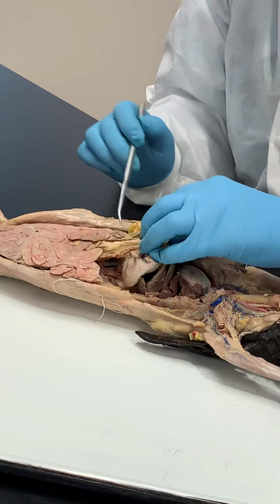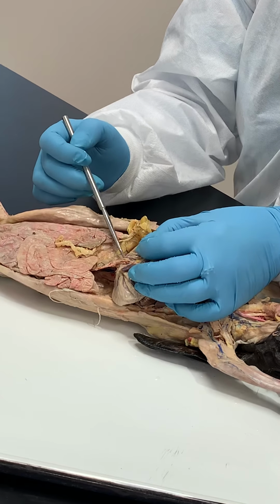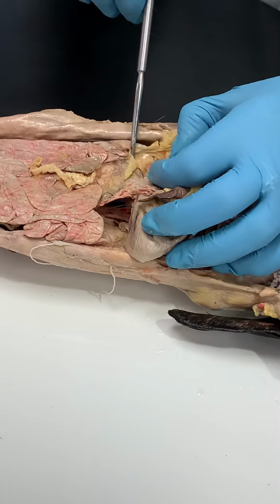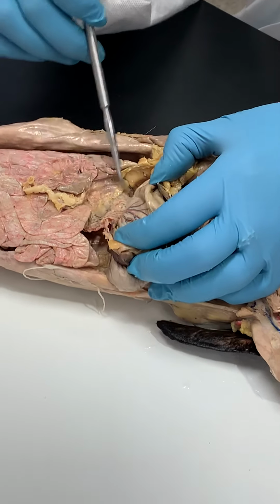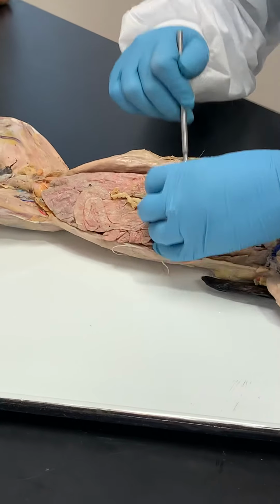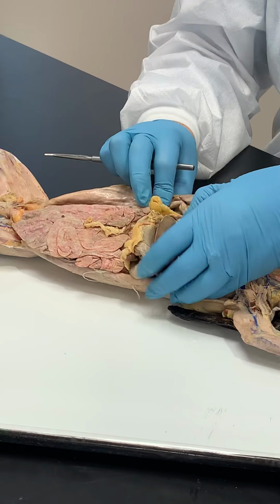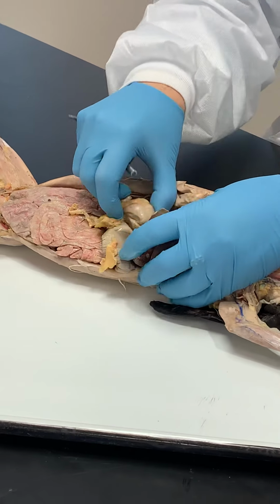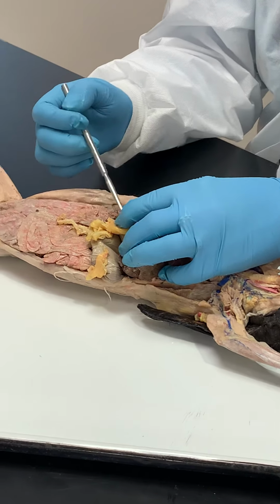Okay, you work your way down to, and you pull this up, and underneath the stomach is the pancreas, just like we said. And this pancreas is not real obvious. Okay, it's over here, and it comes all the way across here. Okay? This is liver as well. It comes all the way, kind of sits on top of the kidney on the right side. And then over here, your stomach kind of ends, right? This is going to be your pylorus region right here. And then your intestine is going to start here.